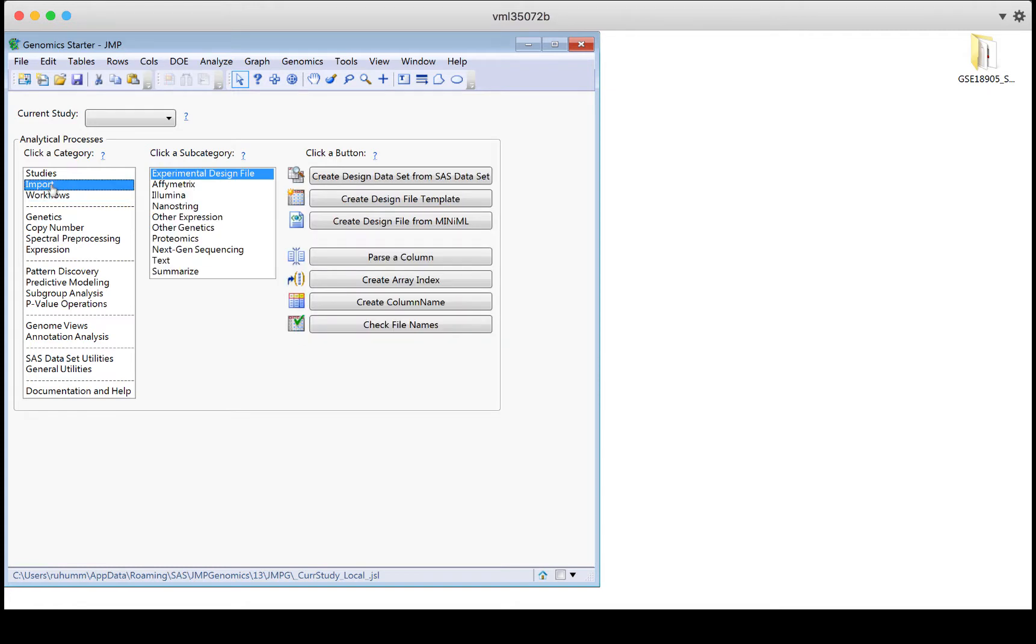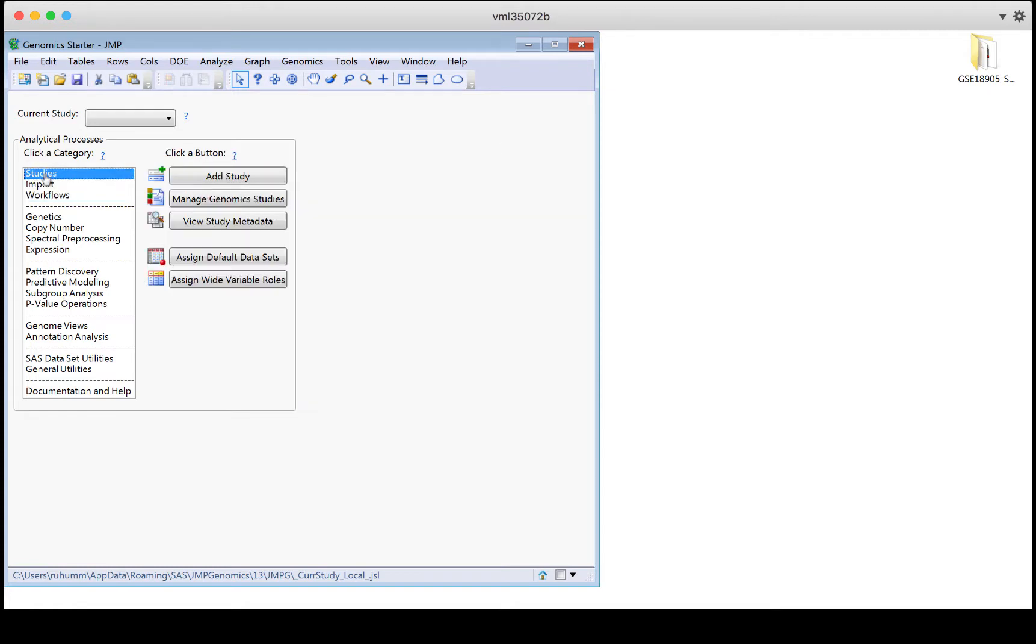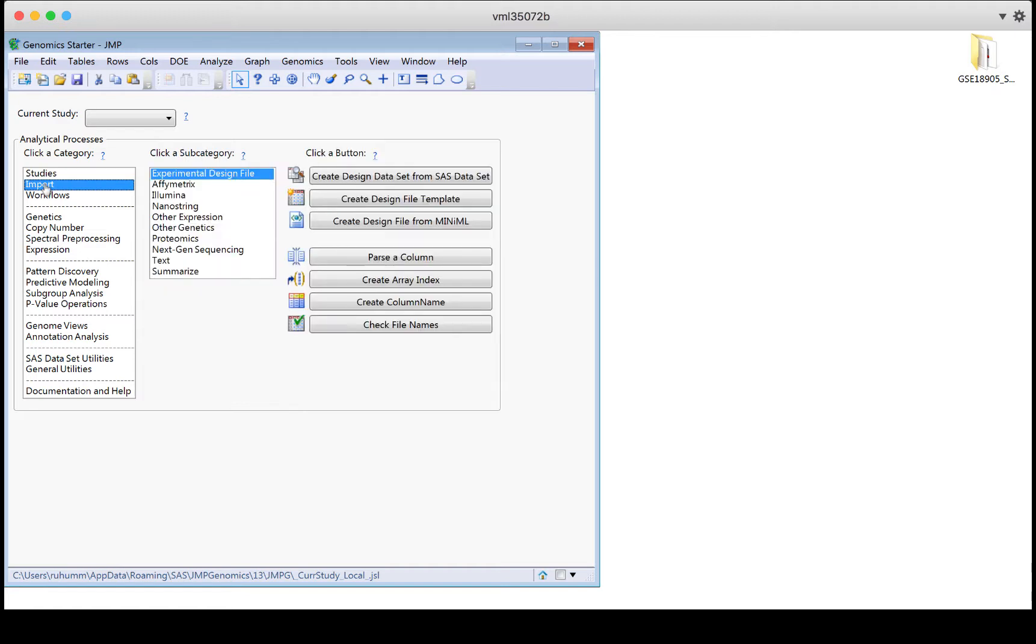But again, you don't have to use a study. You can go straight to the import and begin by loading your data here. But whether or not you use studies, you will need to use import. This is where you can create your experimental design file, point to your raw data files, point to an annotation file if you have one, and ask JMP Genomics to collect all that information into the appropriate data files for other analyses.